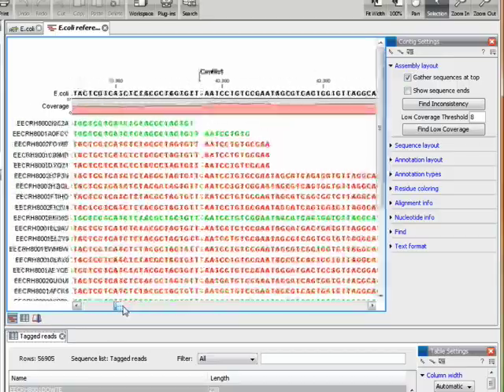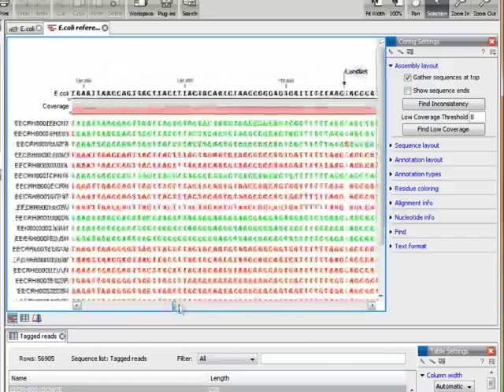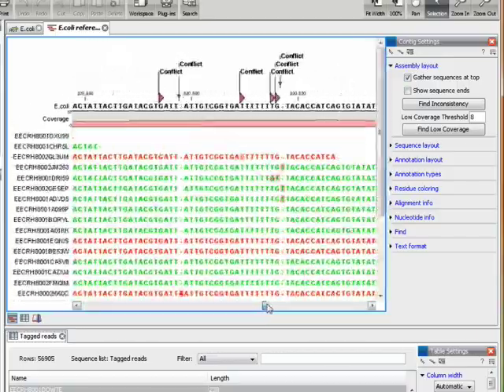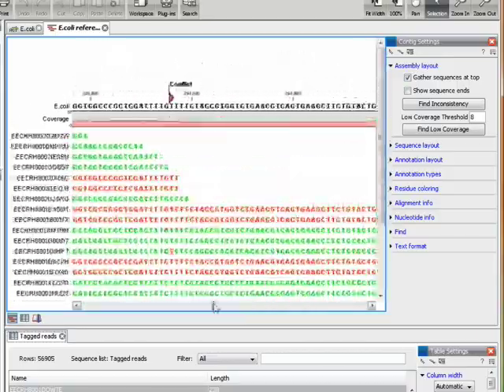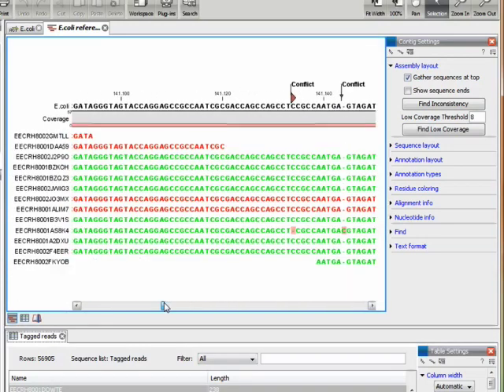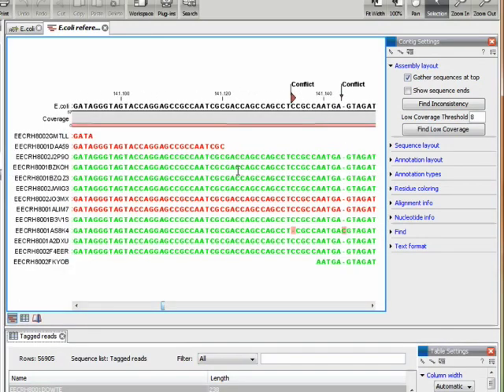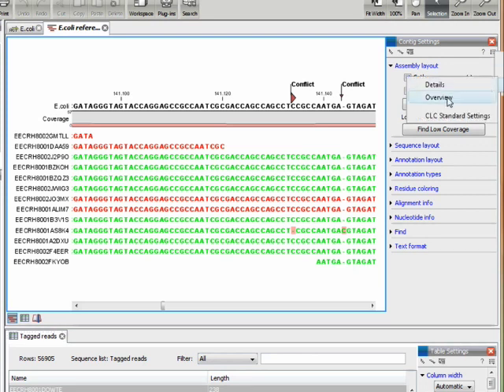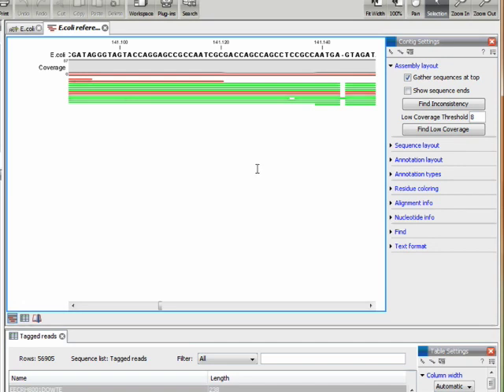You can scroll through all this data and look at it and inspect the conflicts. But for many applications, this view is too detailed. You would like a more high level view.